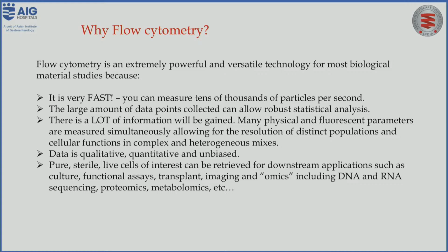Many physical and fluorescent parameters are measured simultaneously, allowing resolution of distinct populations and cellular function in complex and heterogeneous mixtures. The data generated is qualitative, quantitative, and unbiased.